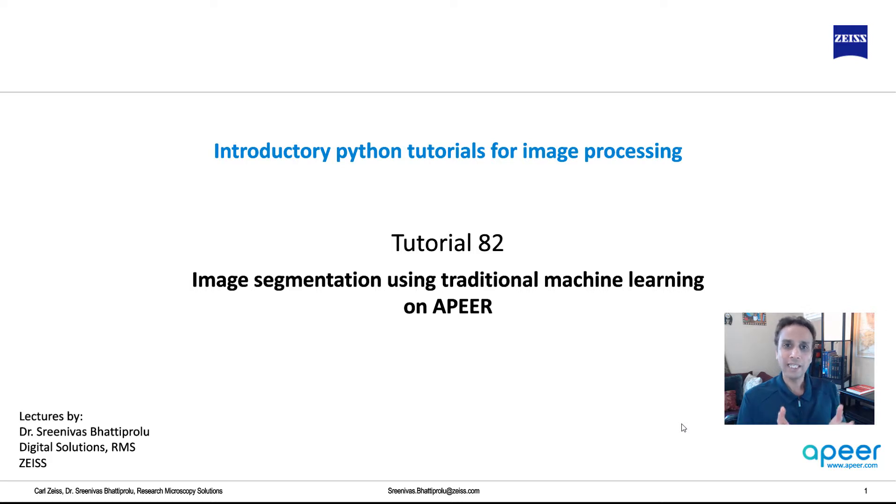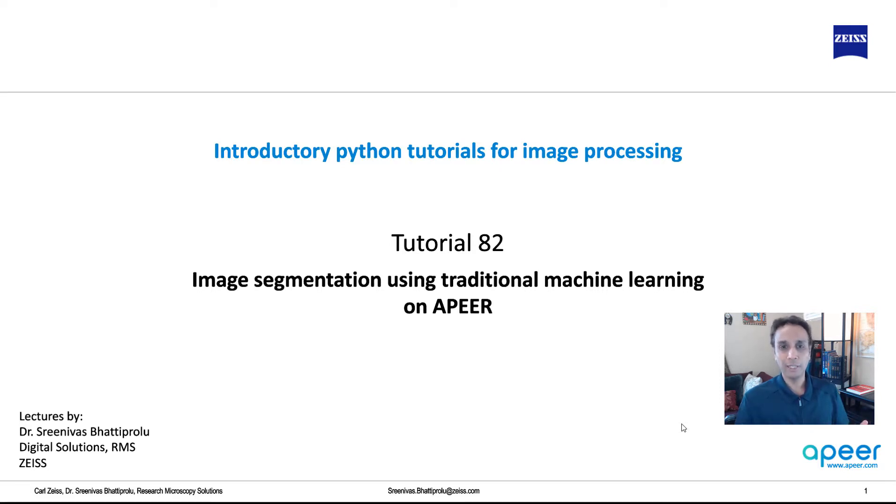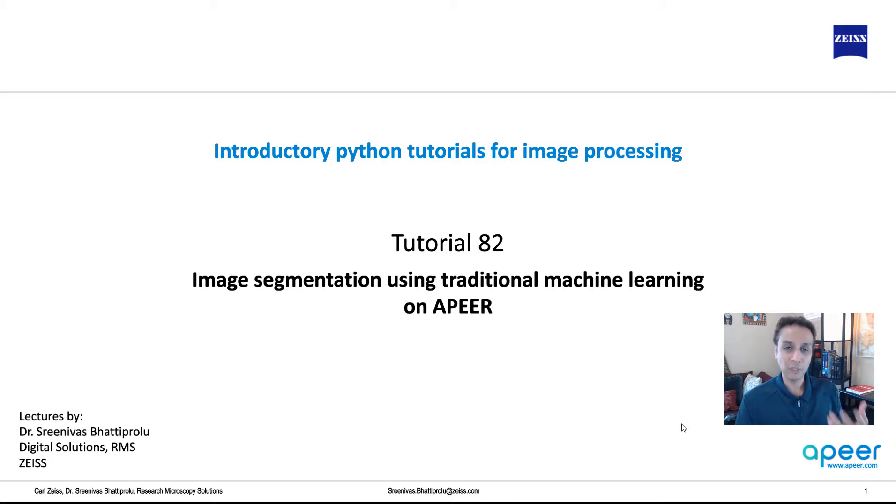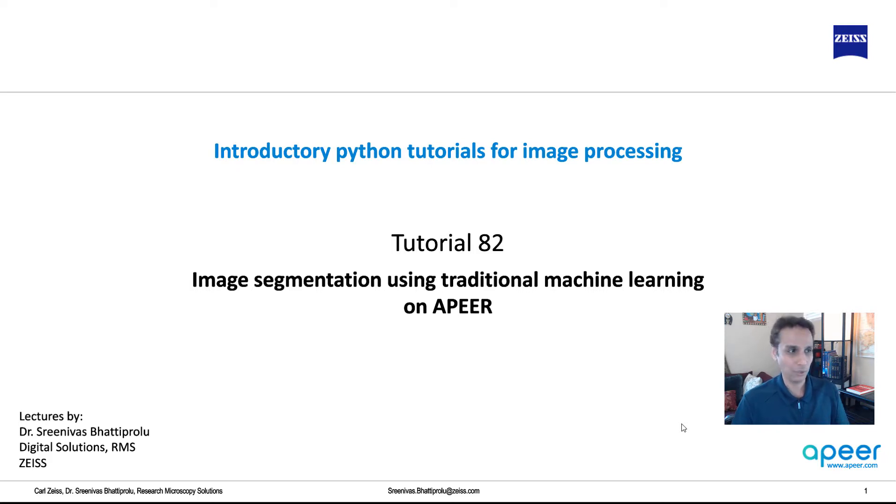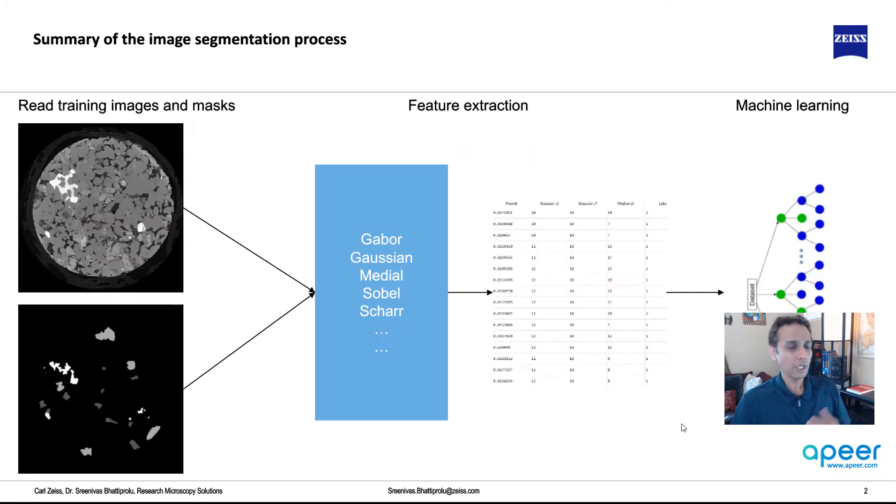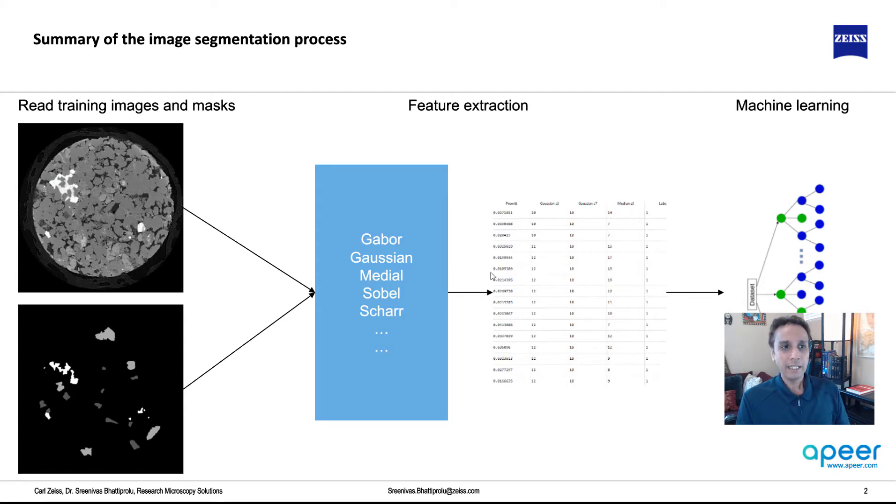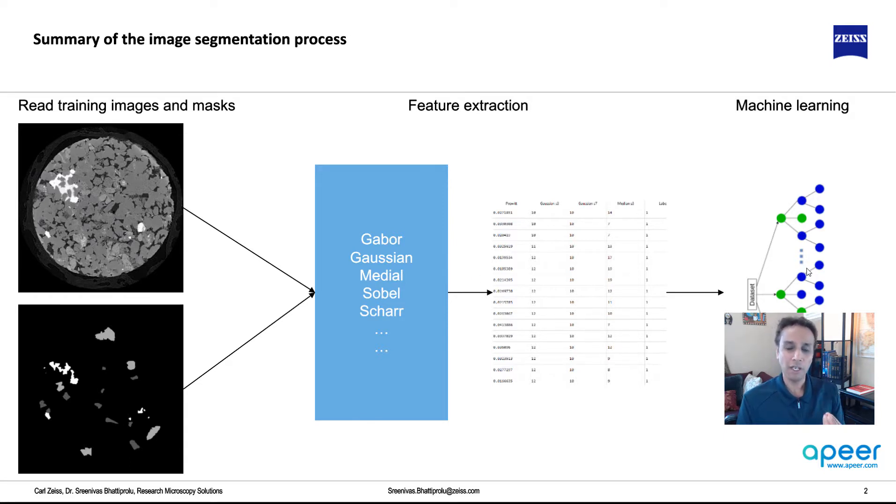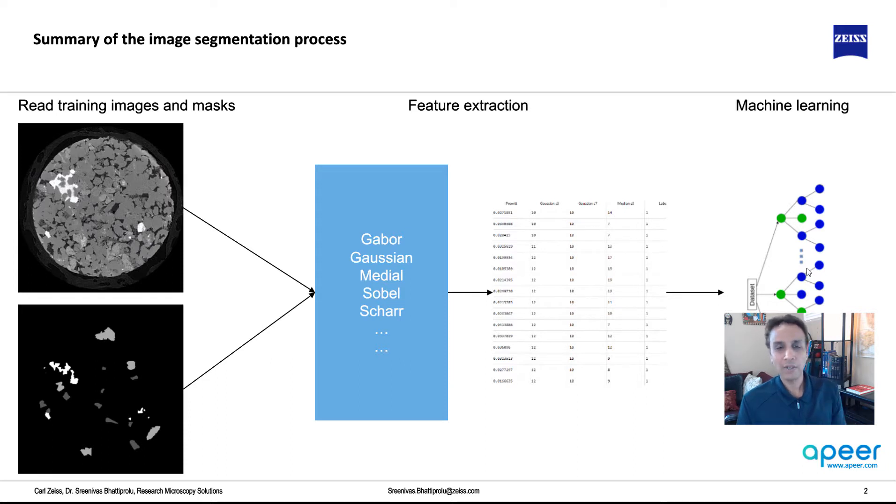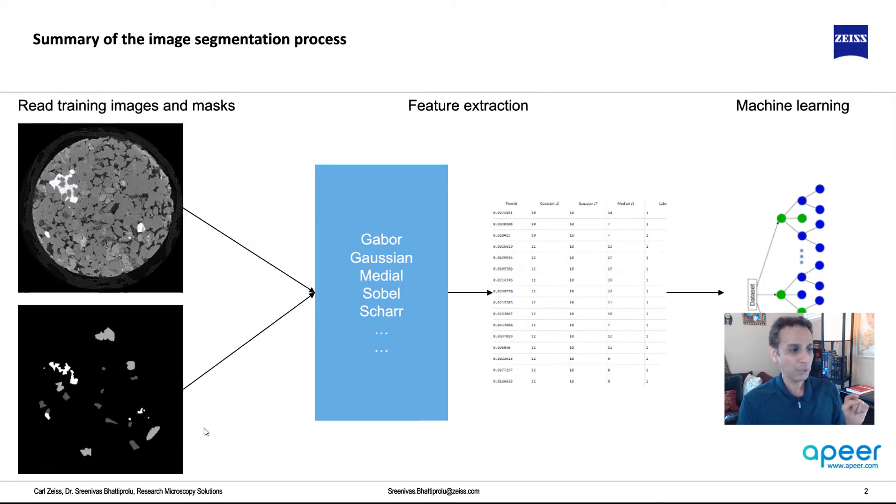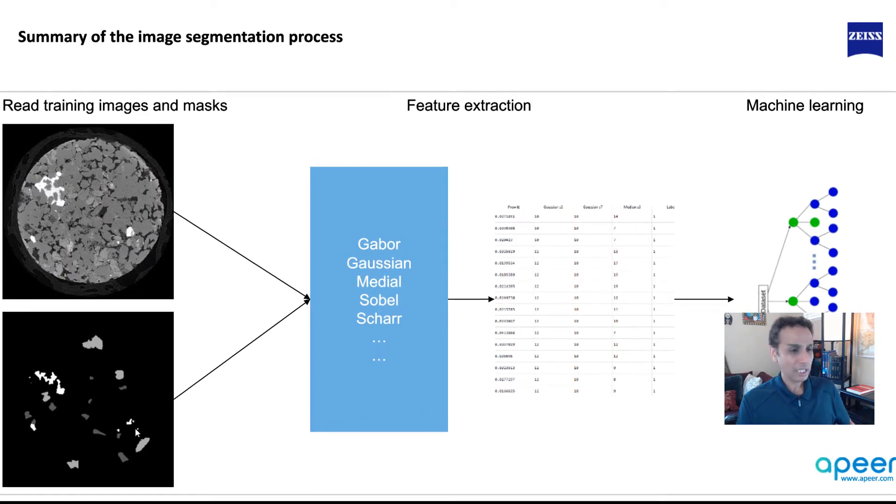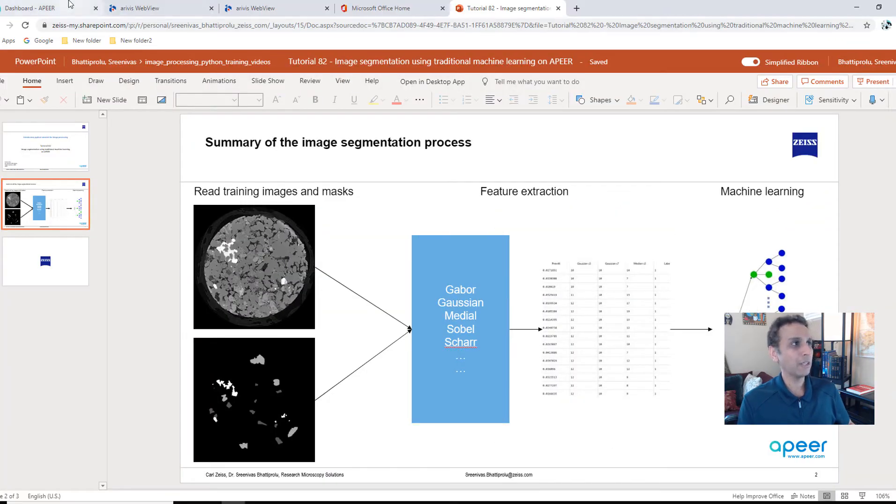In the last four tutorials, we have done exactly this, but where we have coded every line in Python. Now we took that and we created a couple of modules on APEER platform. So you can just upload your image stacks and you can just go ahead and segment your images. It works on most images, so please go ahead and check if it's working for your images. Let's have a quick look at that on APEER.